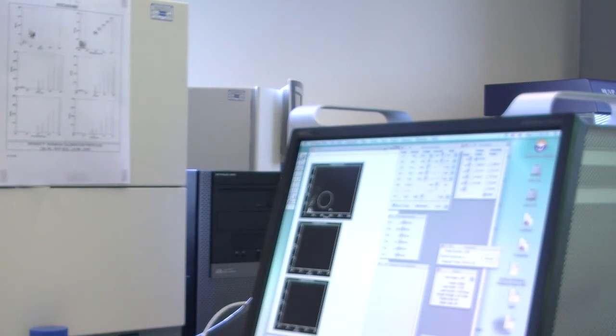Because when we get that PBS, we can straight transfer the sample into the new tube. So I will say aspirate first all the media, and after, when you have removed all the supernatant, you then can add the PBS, resuspend the cells in the PBS, and transfer that into the new tube. Right? That's fine.